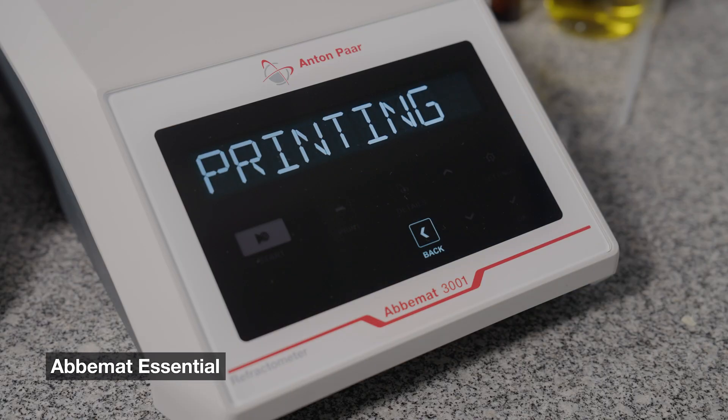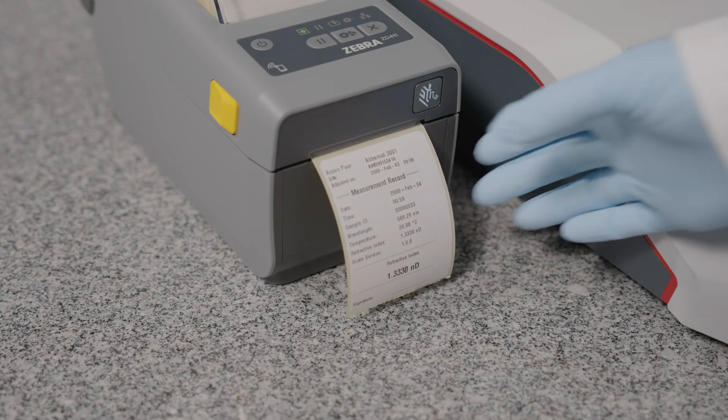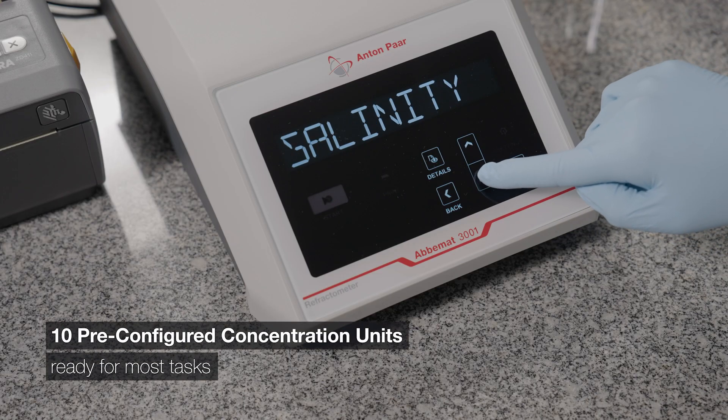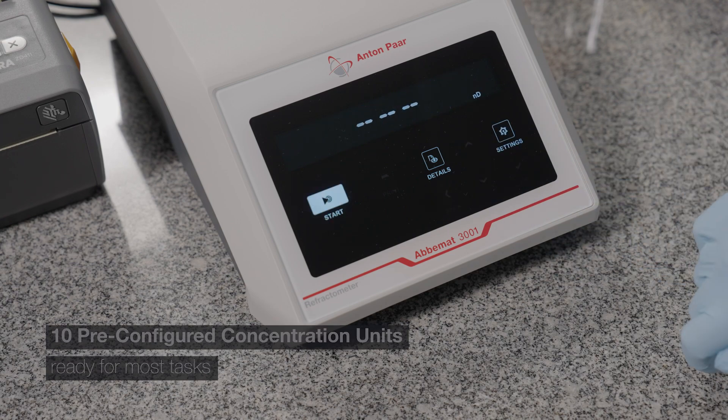Abiumat Essential can be used right out of the box. It sends your results straight to a label printer. With 10 pre-configured concentration units, including bricks, it is ready for most standard tasks.